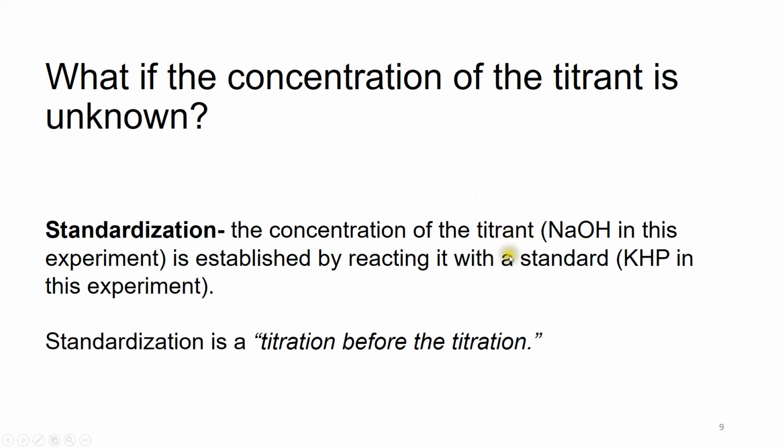In this experiment, we'll use a standard, so-called KHP, to determine the concentration of sodium hydroxide. There's a 1-to-1 ratio between KHP and sodium hydroxide. 1 mole KHP reacts with 1 mole sodium hydroxide. So this standardization is pretty much just a titration before the titration.